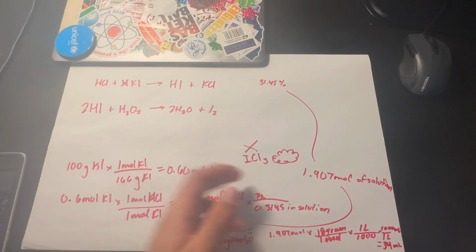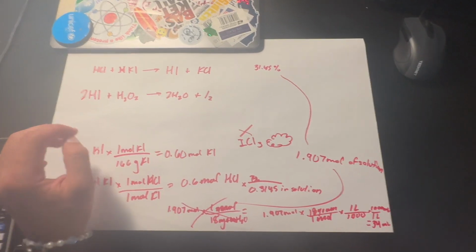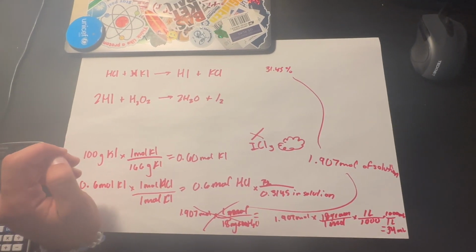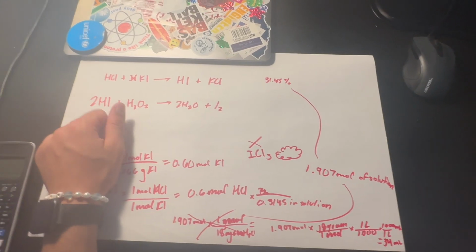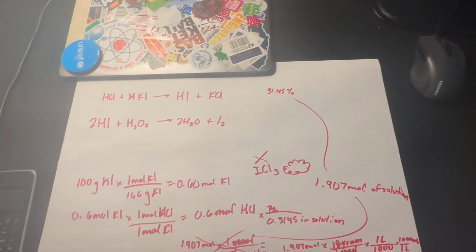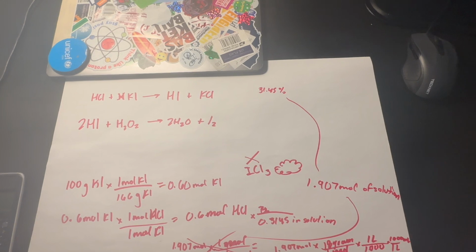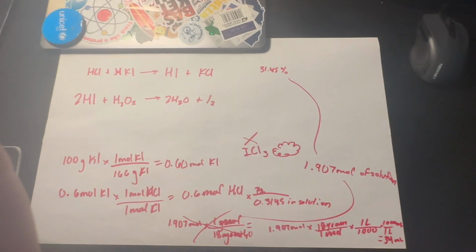So I'm going to probably be doing this later, but it would be very unsafe to do it in this kind of way with extremely corrosive acids that would be exploding everywhere. So I'm going to do it in my fume hood, and I'm going to do it with the droppers slowly. So if I see any gas being produced, I stop.